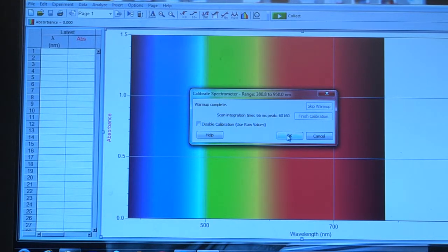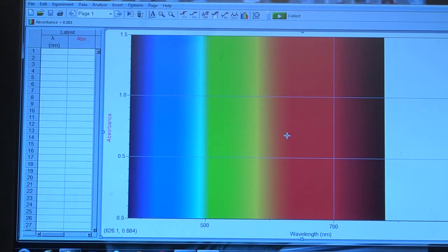And it's telling the software that 100 percent of the light is being transmitted with the water. Now that we are calibrated.